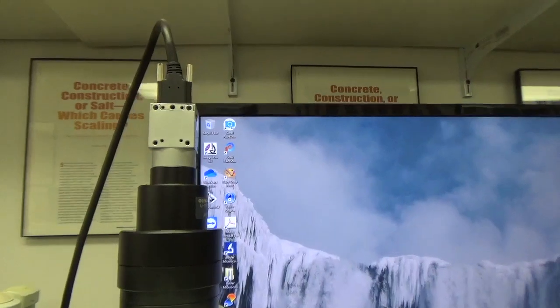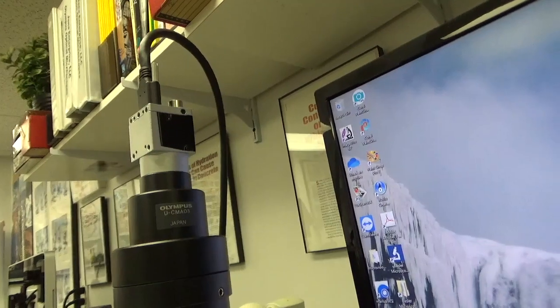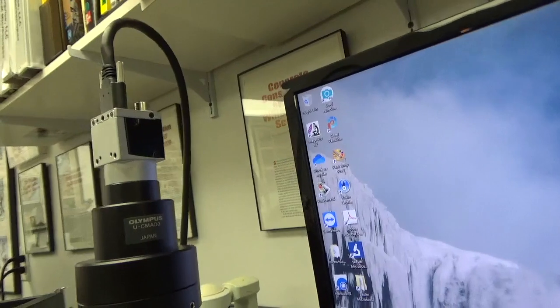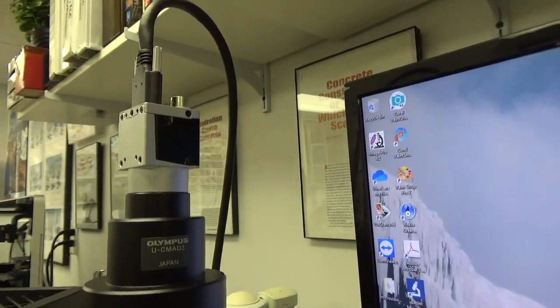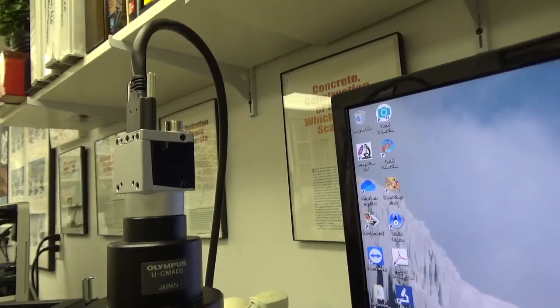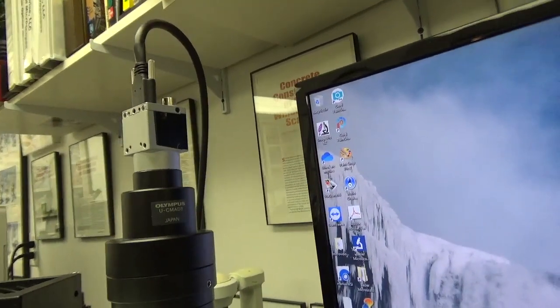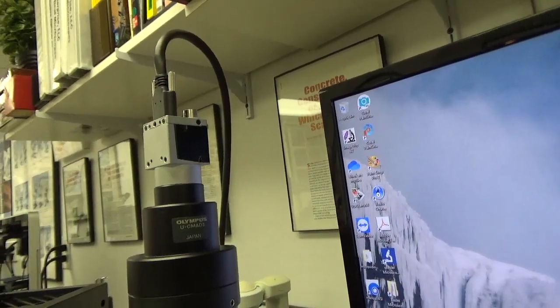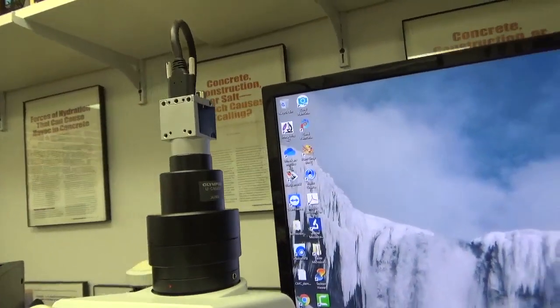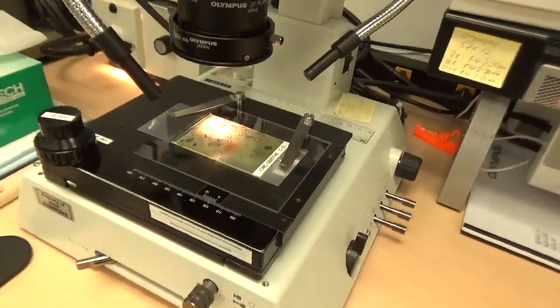So we use this Basler ace 2500-60uc camera, where 2500 stands for 5 megapixel resolution, 60 is the 60 frames per second frame rate, and UC is the color USB 3. We need the USB 3 camera for the fast scan. So the high frame rate, USB 3, and global shutter are the three requirements, and this Basler camera works really well for high-speed scanning of the thin sections.